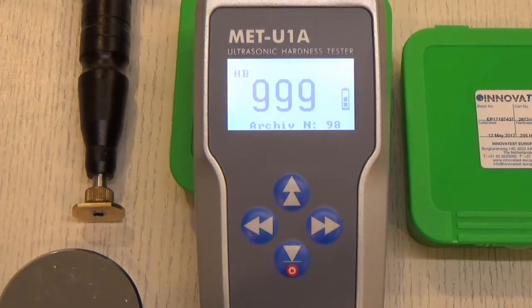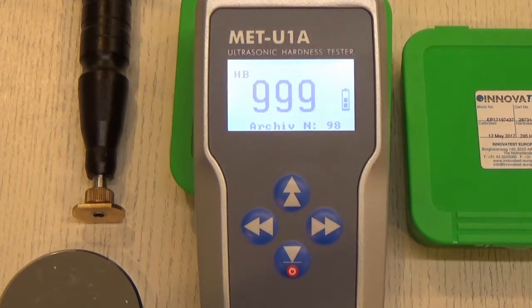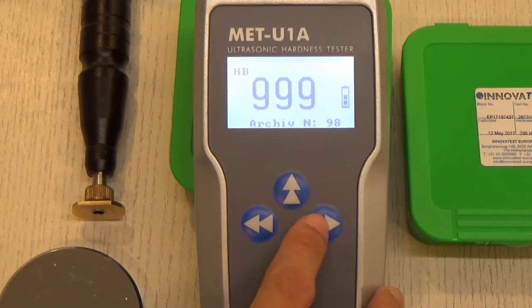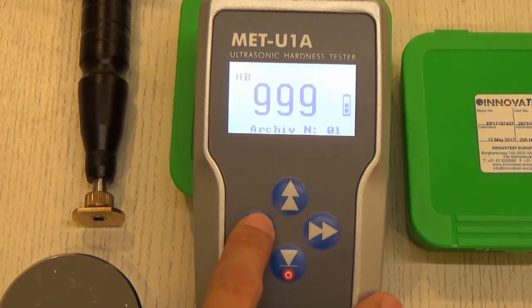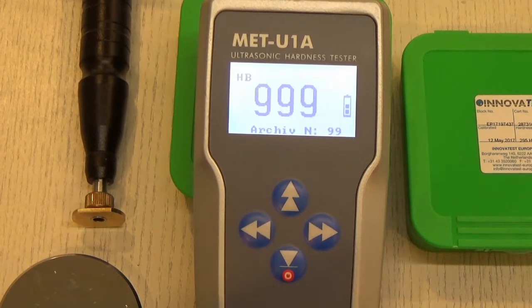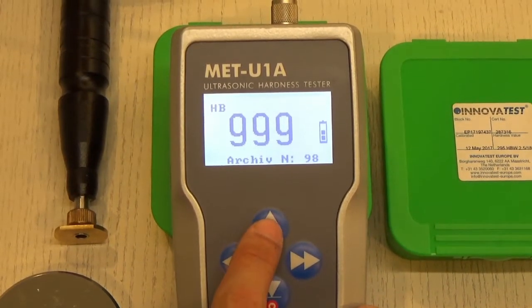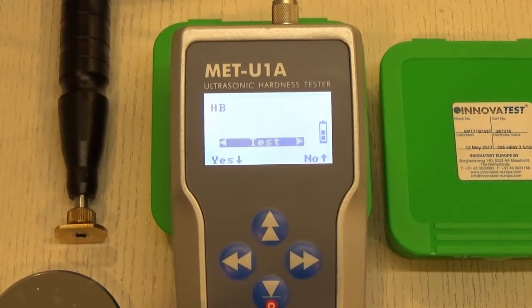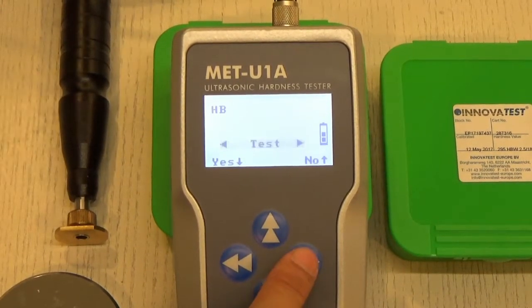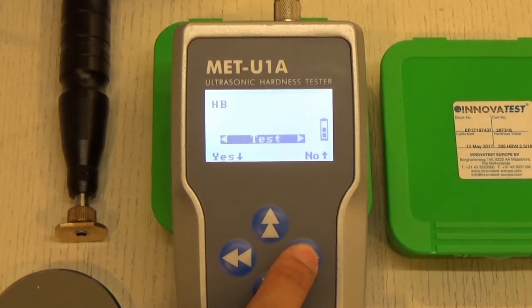The first page you see is the archive, where you can select from 1 all the way to 99 for the archive. From the archive page, if you press the up button, it will go into the settings page. The first option you will see is 'Test'.